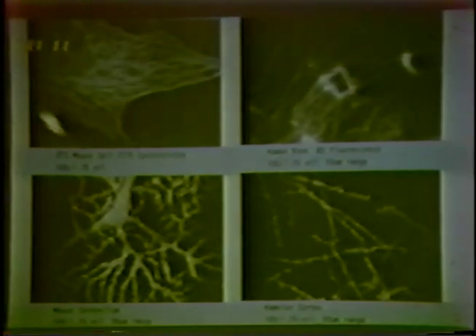And that's a very important step forward in the use of lasers as the illumination. And these are some images which I recorded on their microscope on a visit there some months ago.